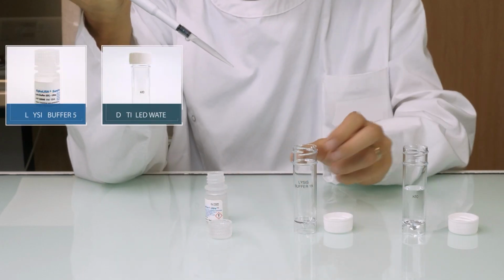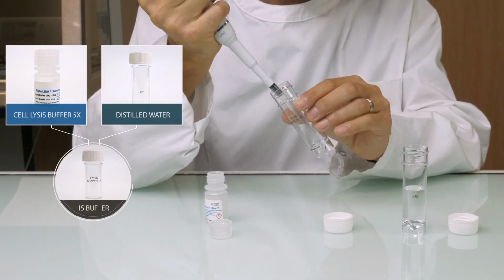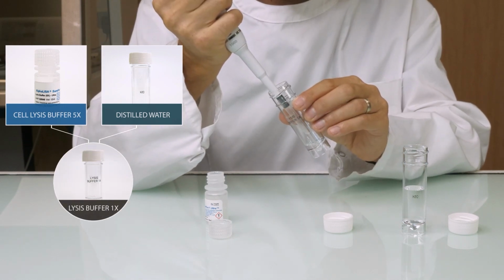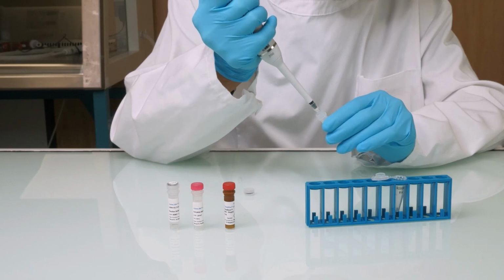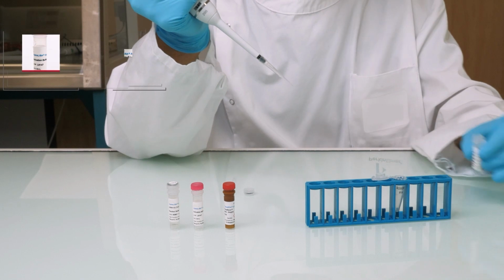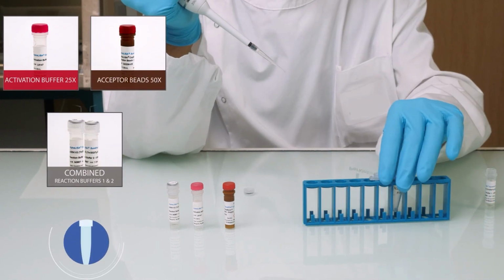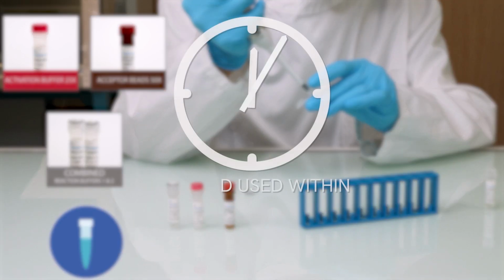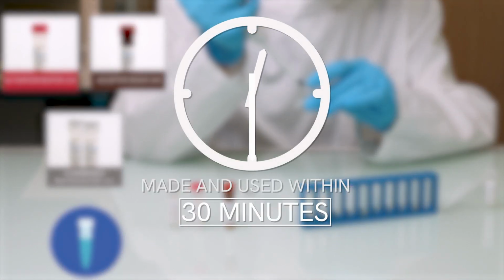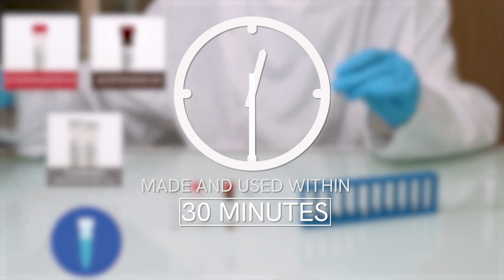For cell lysate generation, start by diluting the cell lysis buffer 5 times with water. To prepare the acceptor mix, start by diluting the activation buffer 25-fold and the acceptor beads 50-fold in combined reaction buffers 1 and 2. For the best results, the acceptor mix should be made and used within 30 minutes.